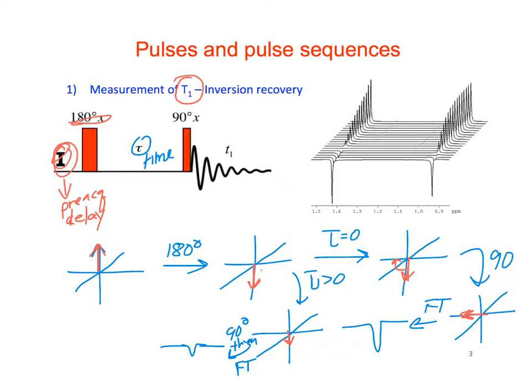Okay, if we waited even longer, then if we waited long enough, this signal would start to be going in the plus direction.